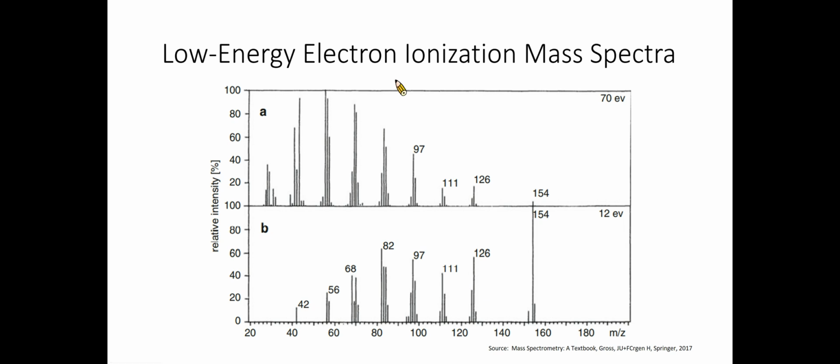However, there are also some disadvantages of using low-energy electron ionization, such as loss of sensitivity and carryover effects. Nonetheless, during the first decades of analytical mass spectrometry, low-energy EI spectra were the only way to minimize fragmentation, and thereby to increase the relative intensity of a weak molecular ion peak. Nowadays, EI mass spectra are preferably complemented with spectra obtained from so-called soft ionization methods, which we will introduce in the following content.